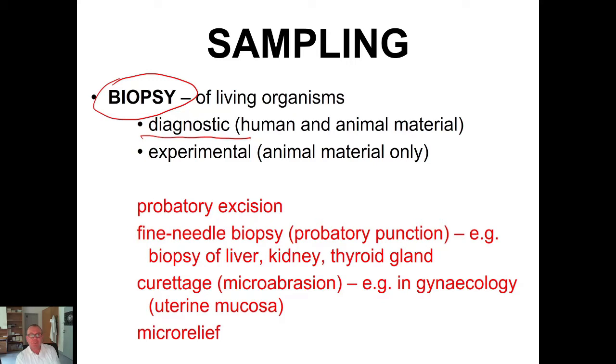Needle biopsy, or so-called punction: you probably know that liver or kidney or thyroid gland can be evaluated by this method in pathological laboratories.